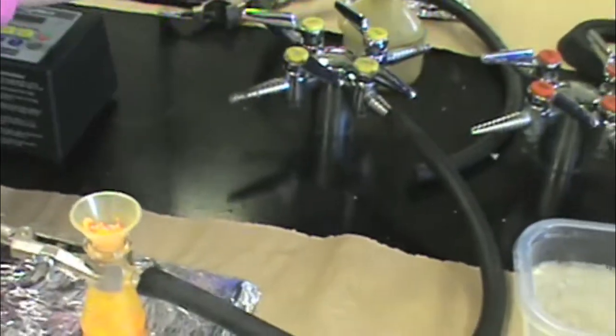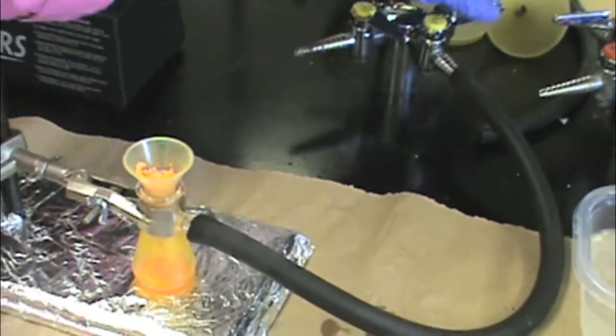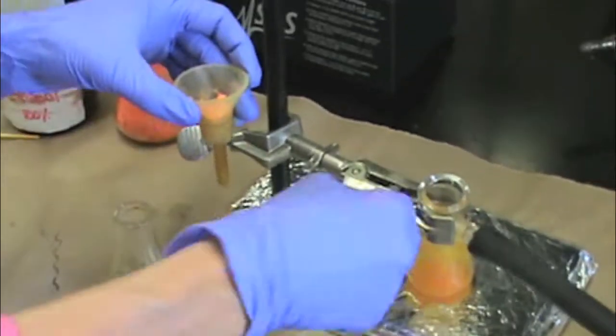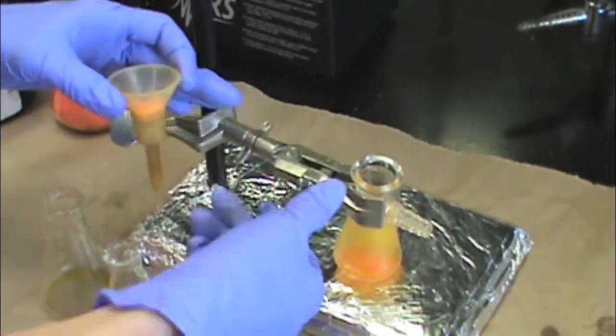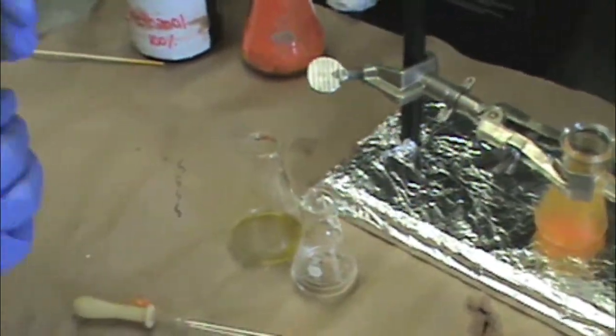Once you are finished filtering and your crystals look dry, you can turn the vacuum off, take your crystals out of the flask, remove the hose from the sidearm flask, and clean the sidearm flask using some acetone into the waste bottle.